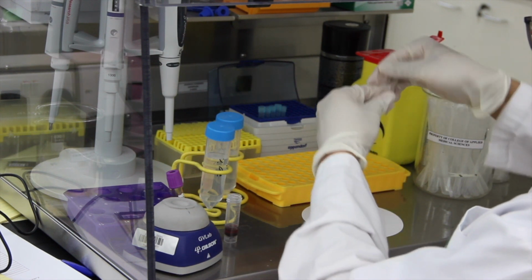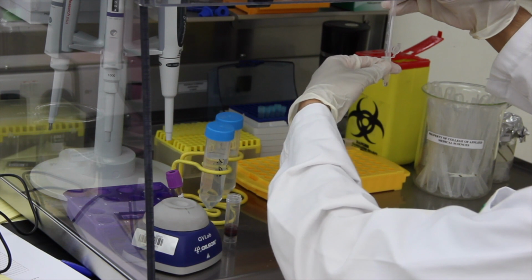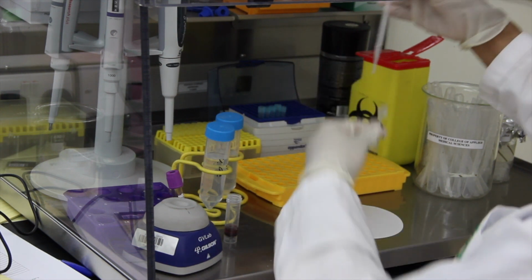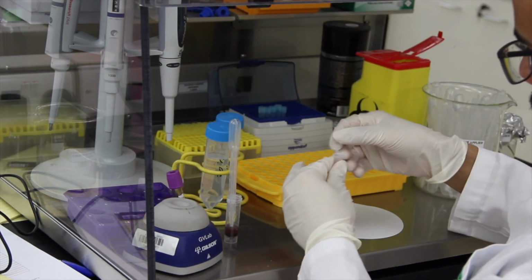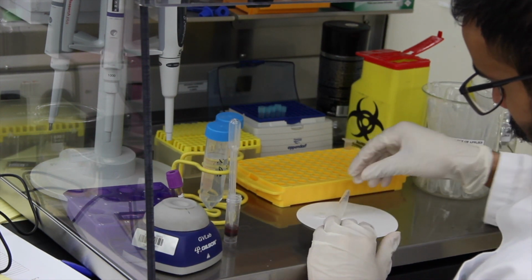Discard the supernatant but with care because the pellet is loose now. Now invert the tube and let it air dry for 10 to 15 minutes.